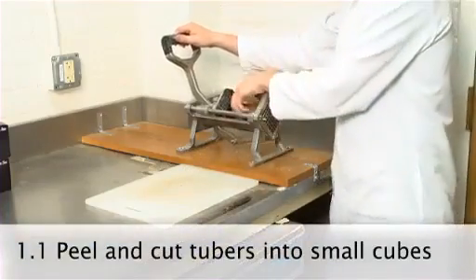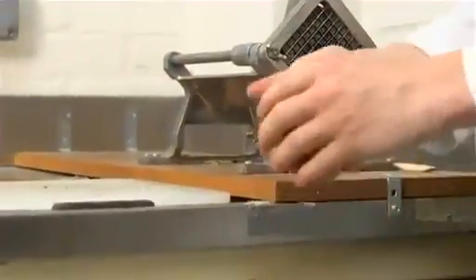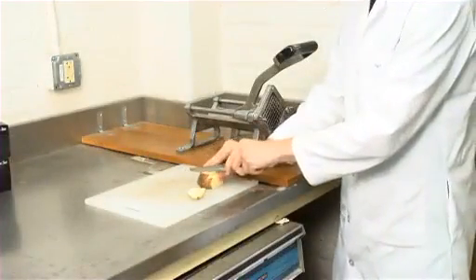Fresh potato tubers are used for this method. Dice the tubers into approximately 1 centimeter cubes and discard pieces containing skin. A French fry cutter allows this step to be carried out efficiently.